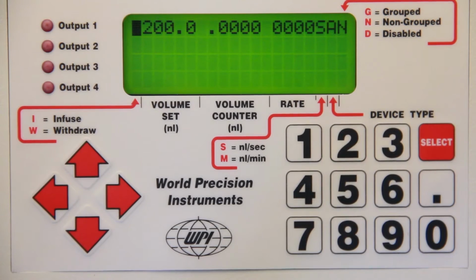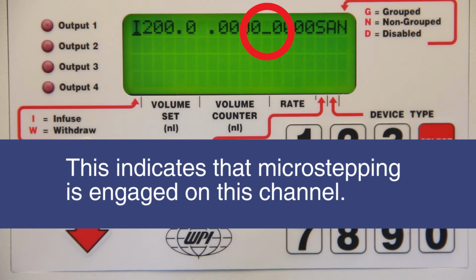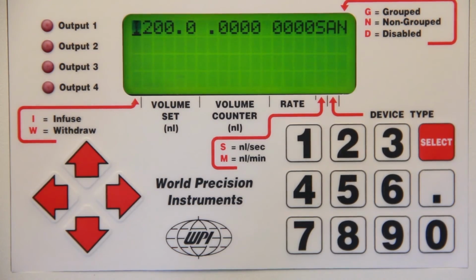The 6 button turns on Microstepping. That is, it causes the pump mechanism to move in fractionally smaller steps than normal. Microstepping is useful for smoothing out undesirable pressure pulses in normal step mode and when injecting volumes smaller than possible with a pump's normal step. The 7 button resets Microstepping to the default off.